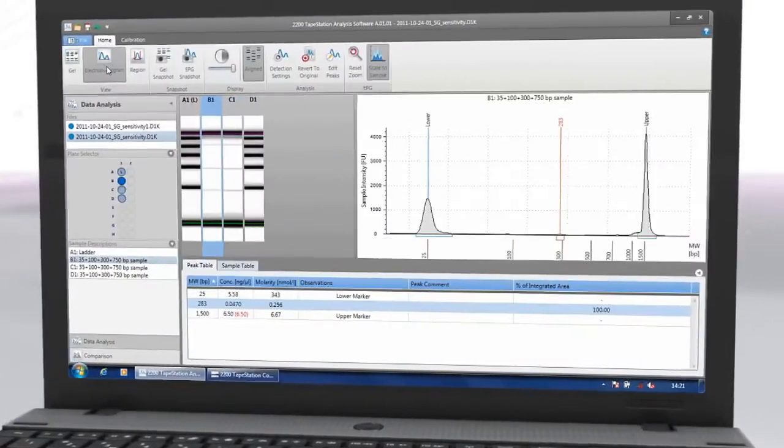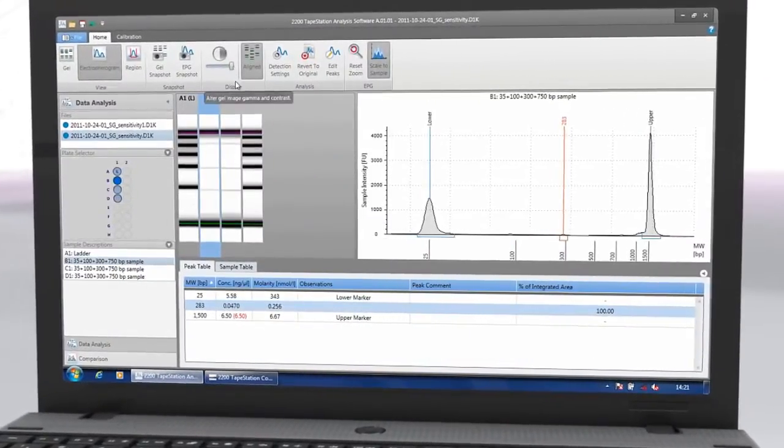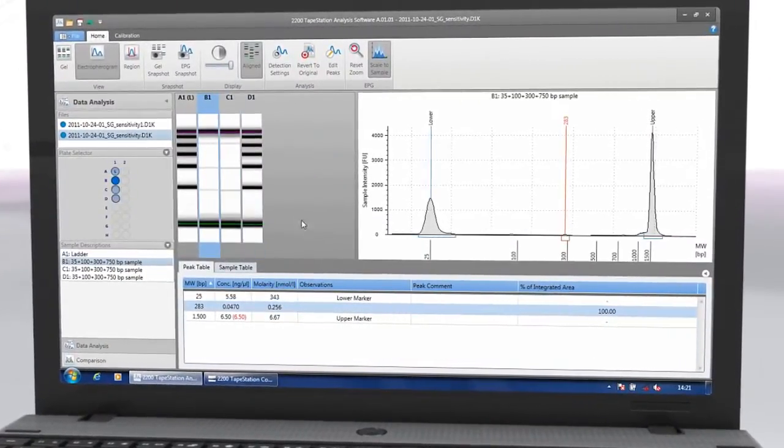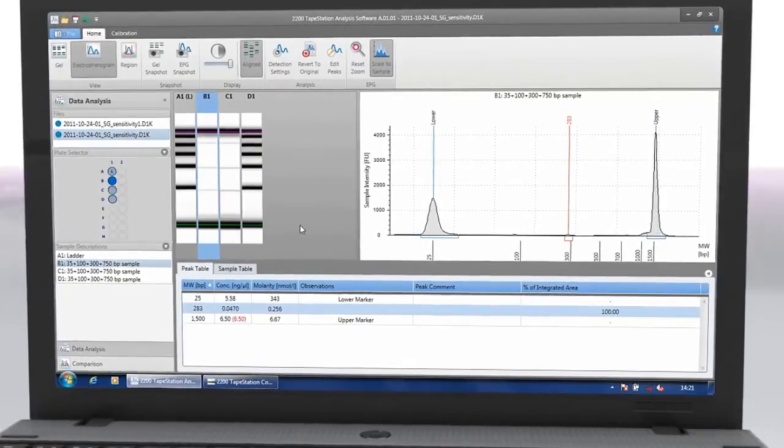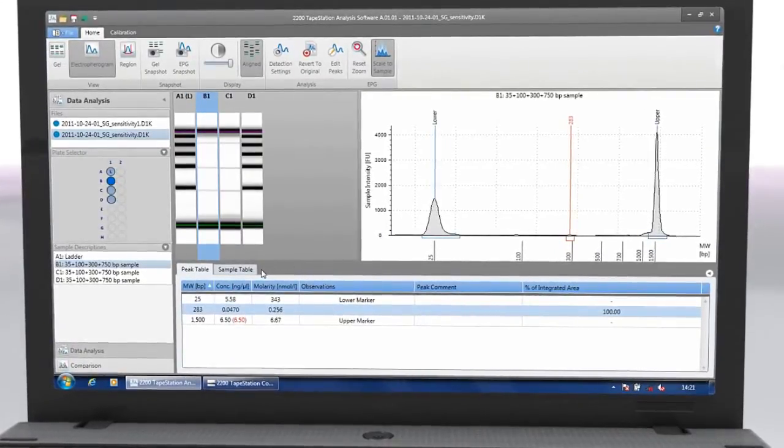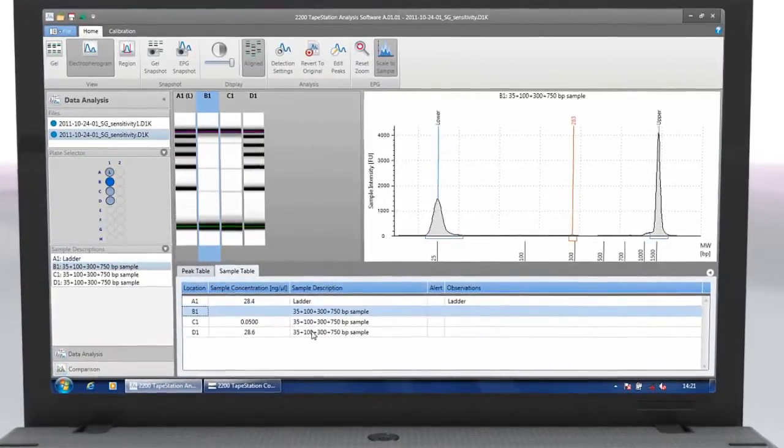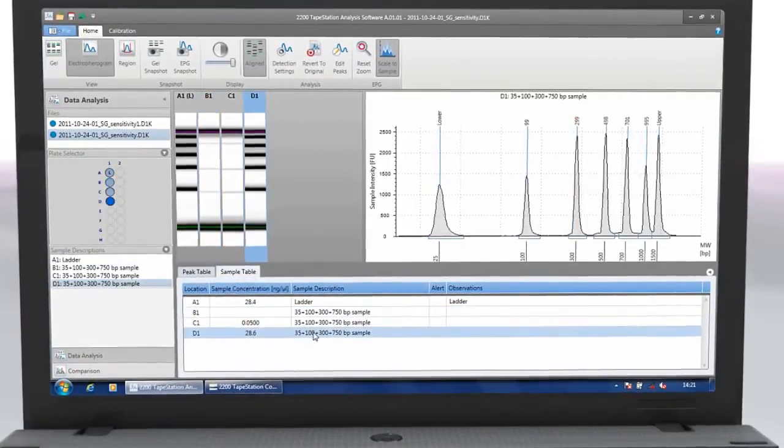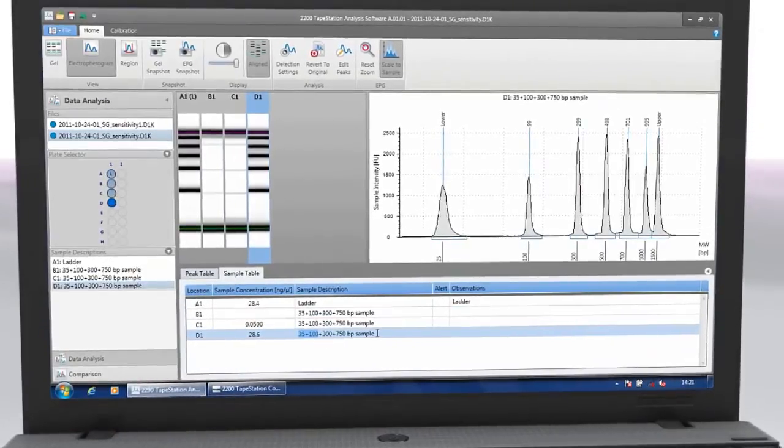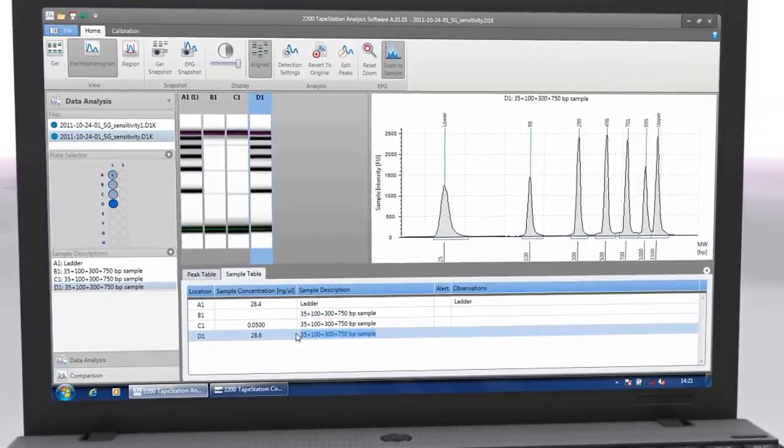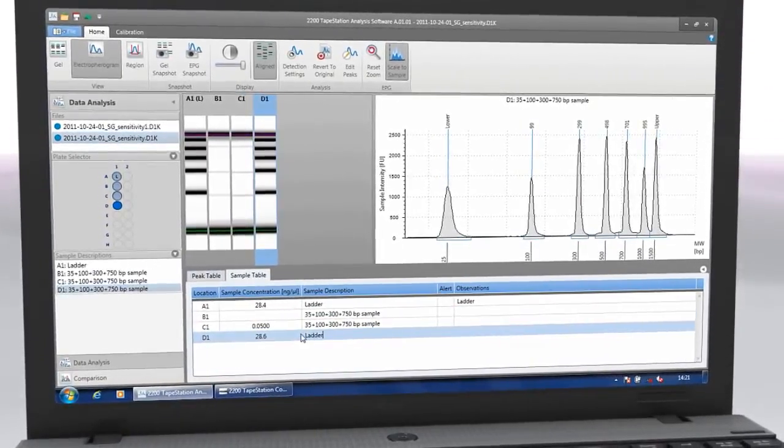Depending on the application, the Agilent 2200 tape station software automatically determines size, quantity, purity, RIN-E or ribosomal ratios, saving time and reducing interpretation errors.